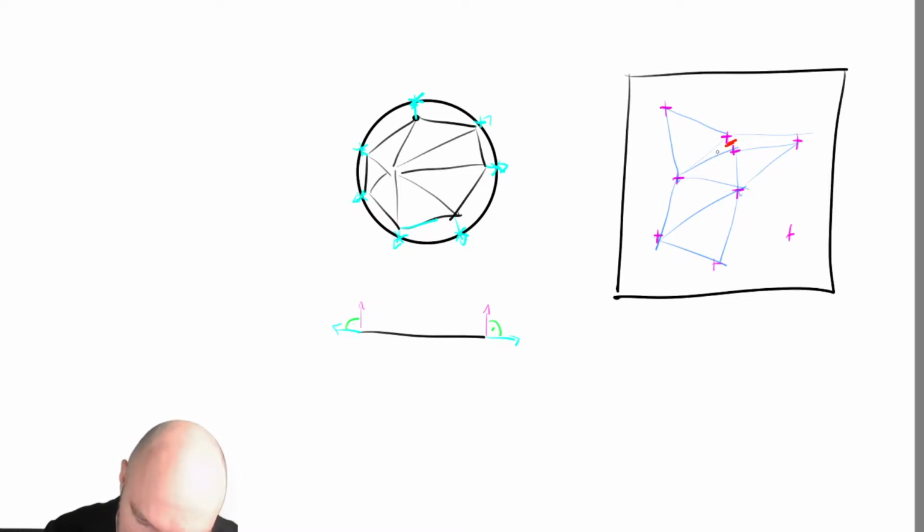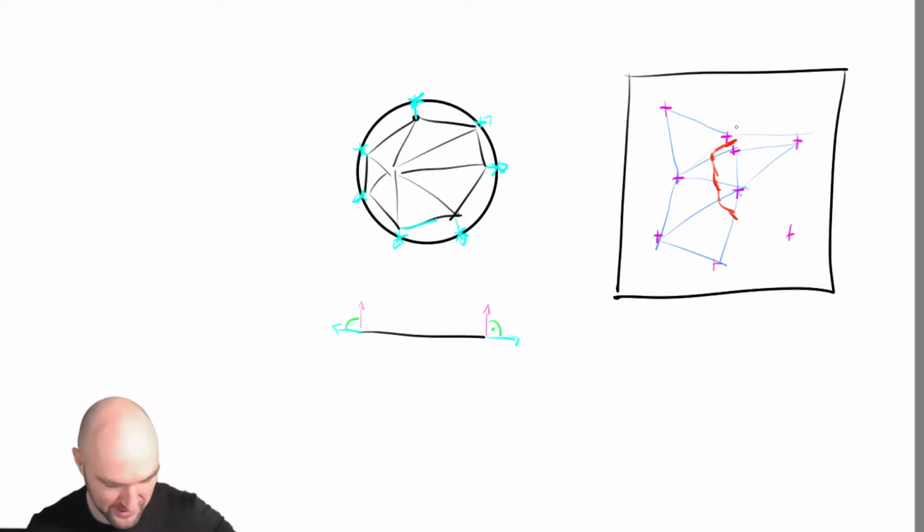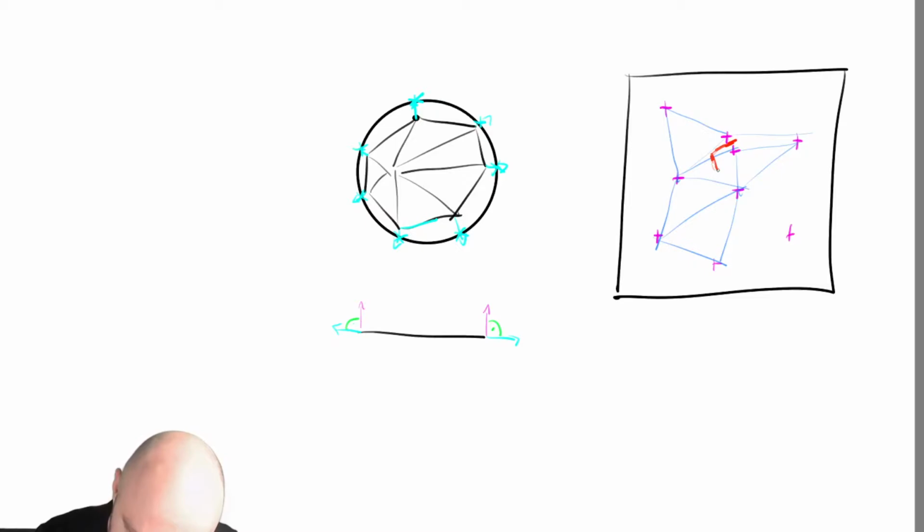The intersections between individual lines here actually give you maybe my Delaunay triangulation was already not that great, but I hope you all understand. I'm already at the next one. That was stupid. I'm already around the next one. So you'll have that here, you'll have that here, and maybe there would be a point sitting up there.